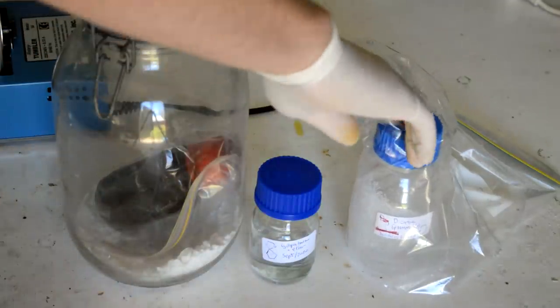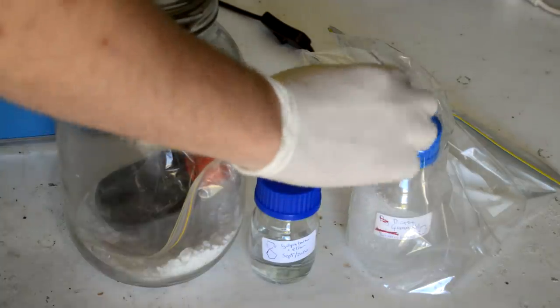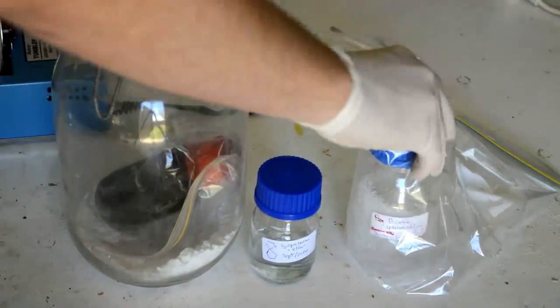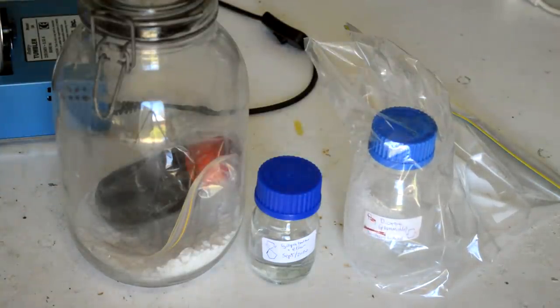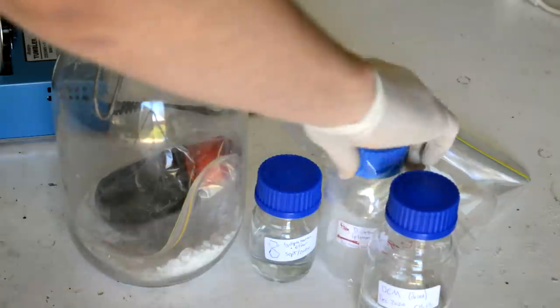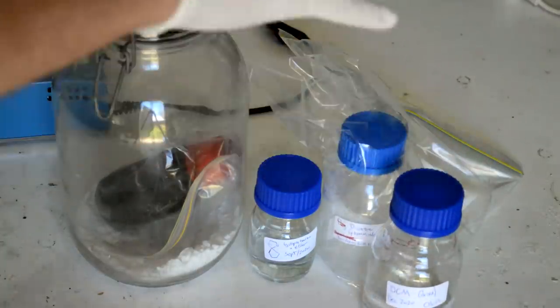And what's frustrating is it's kind of the limiting thing in this case, because we need it both as a reagent, as a bromination sort of species in the middle, but also as a solvent, because we need everything dissolved. The paper from the research lab mentions that you can actually use DCM as a solvent as well. So as long as you've got the dioxane in there, that's fine. You can use much smaller amounts of it and then use just DCM to keep everything dissolved. So that's what we're going to do.